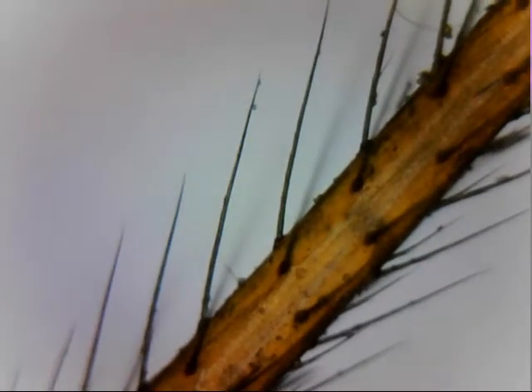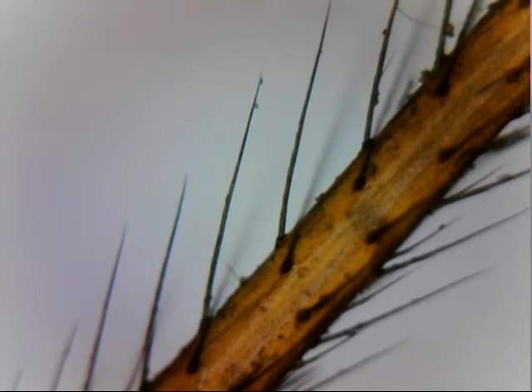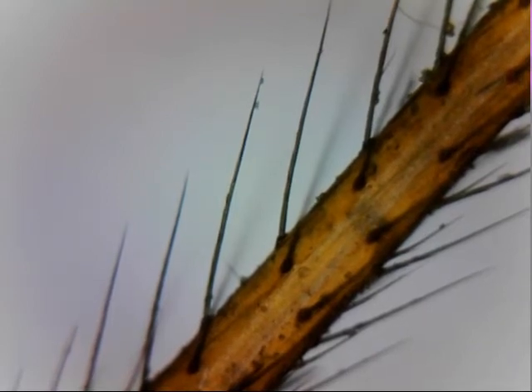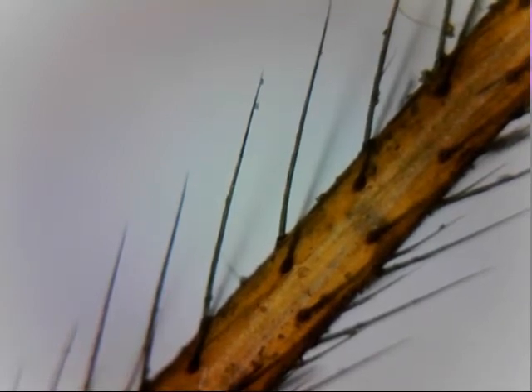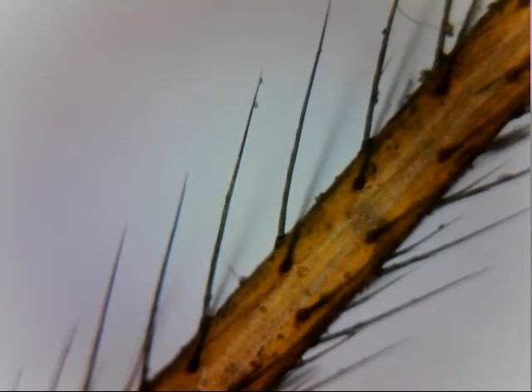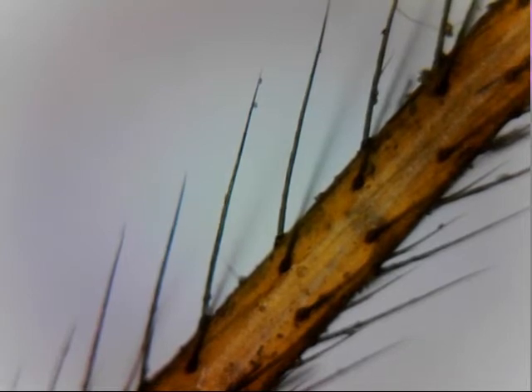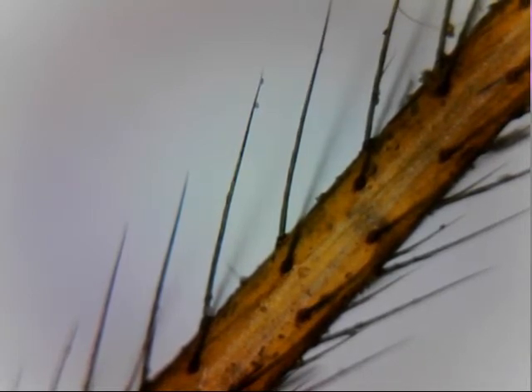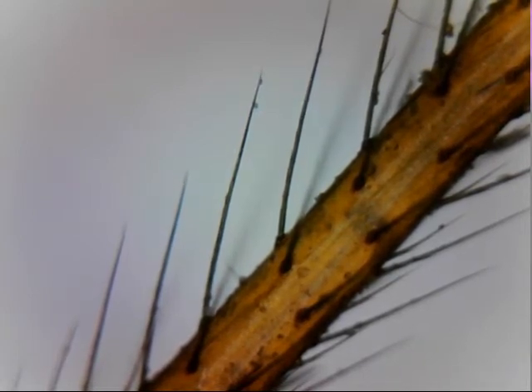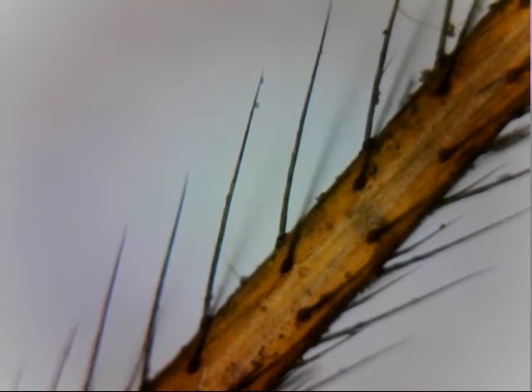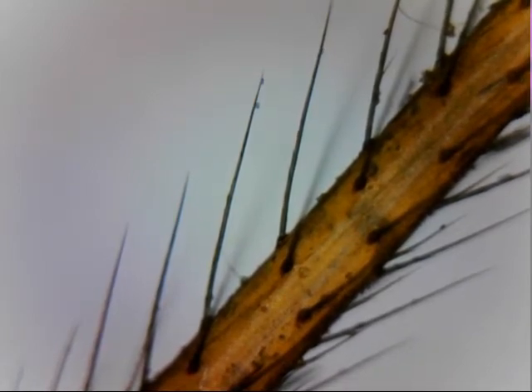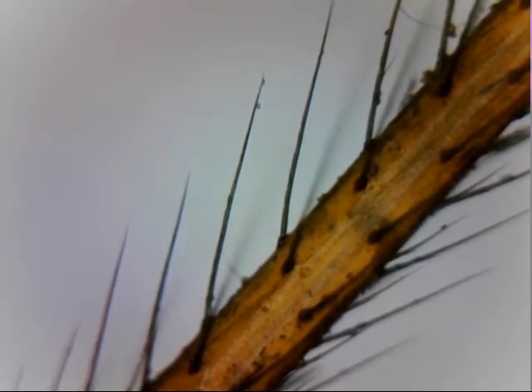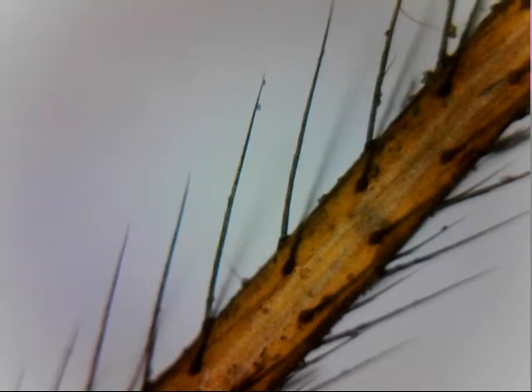I'm going to be honest. This is probably the worst thing I could possibly be doing to myself other than touching it with my hands. The fact that these exist, and there's so many, and they didn't use to bother me because I didn't consider them dangerous, but after this, you can't see those. I just touched my mic, and it scared me.